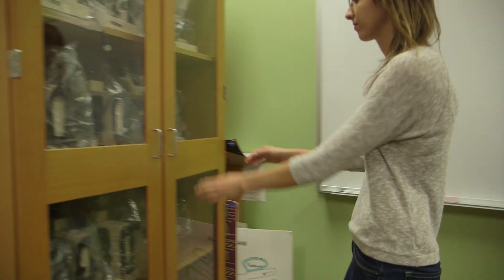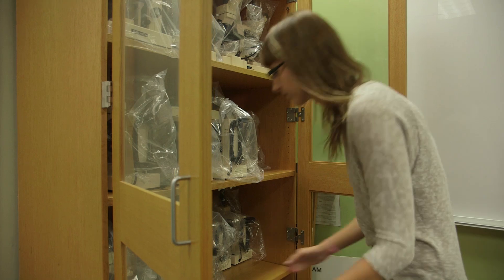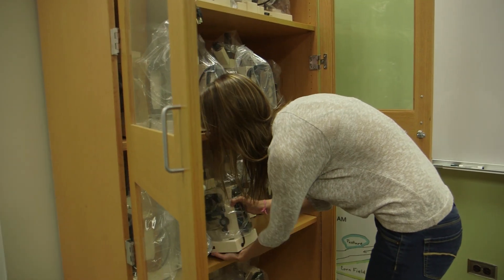Let's get started by grabbing a microscope from the cabinet. Grasp the arm of the microscope with one hand and place your other hand under the base. Set it on the bare table with the stage facing you.